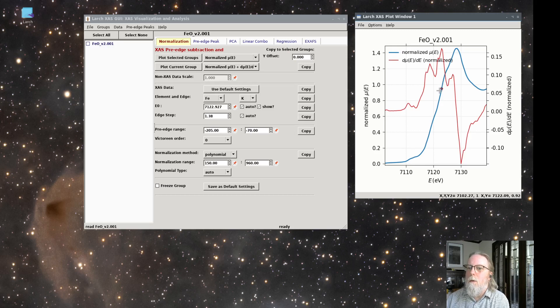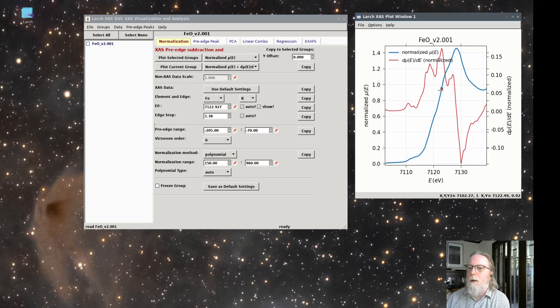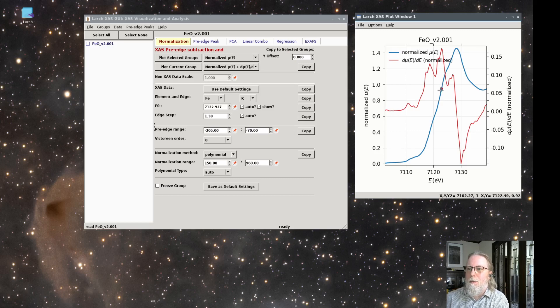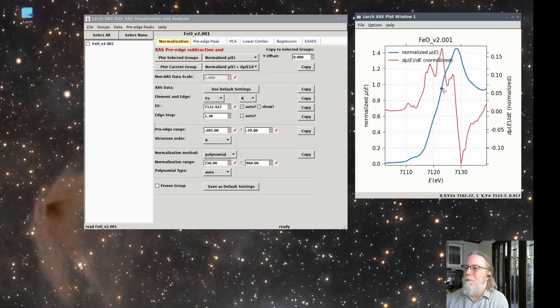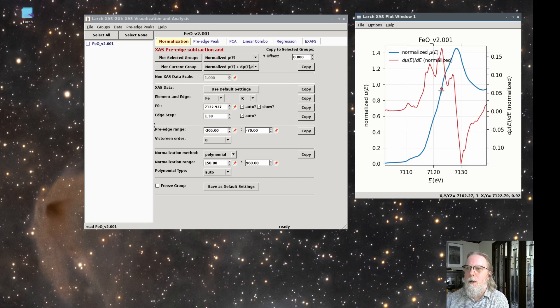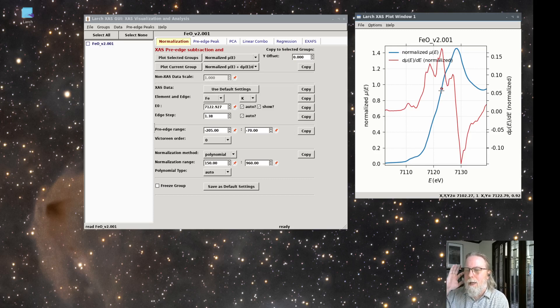But at this point, we won't worry about how it's selected that in too much detail. It's important to be consistent. And picking the maximum of the first derivative is something that you can easily explain to people down the road. So it's a good default. When we get to the point later on of modeling XFS data, we'll have to worry about that value again.